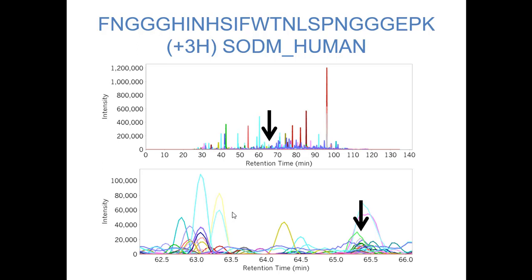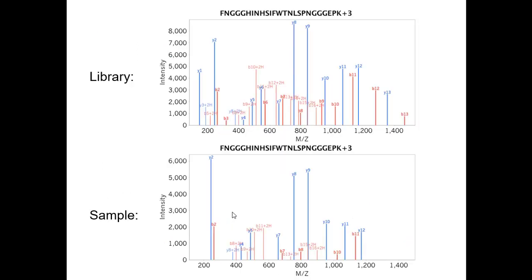But it's kind of amazing to think that this data is as complex as we're looking at. And you actually do see the co-occurrence of many of these fragment ions at the wrong retention time. We know that at least one of these is wrong. This peptide isn't eluting multiple times, right? So what's going on with that particular peptide? What does that actually look like?